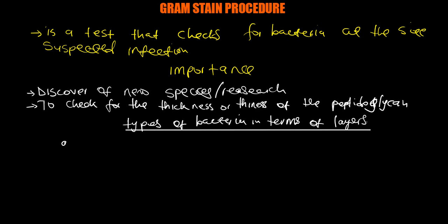So the first one is Gram positive, and the second one is Gram negative.